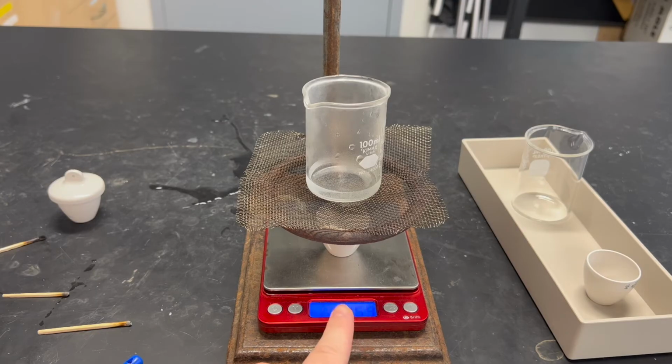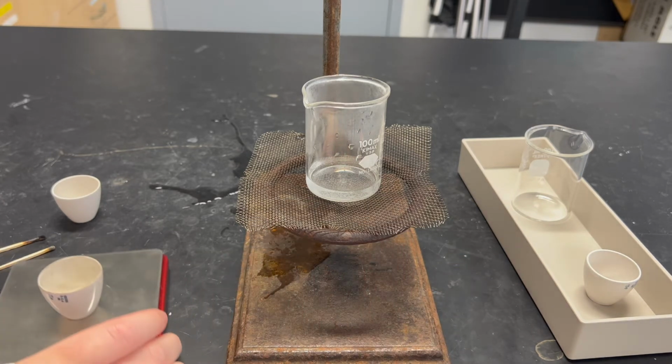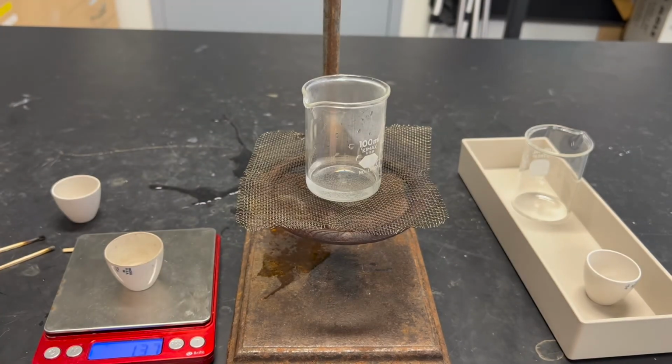When the fire is out, the numbers will stop decreasing and the temperature will stop increasing, and that's how you know you're done. When you're done, you can pull your scale off to the side, leave your crucible on the scale. This is very hot. Same with your water. Let them cool down a little bit. Do not touch them until they have cooled down, and then you can clean them up.